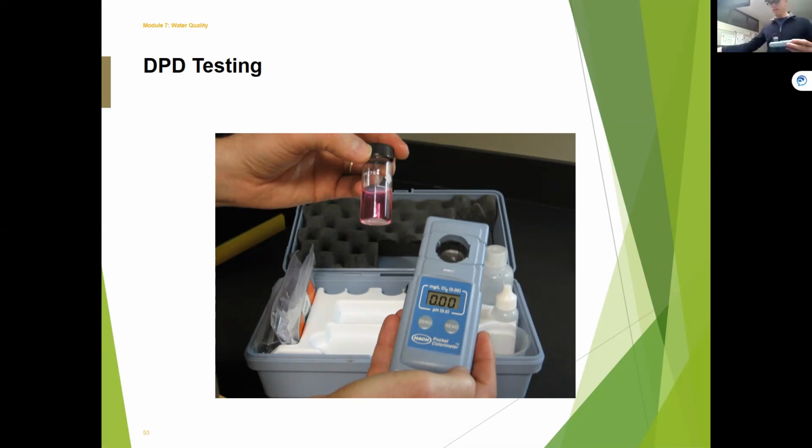When that goes in here and you shine that light source through there, you want to make sure that it's going through the vial, and that the glass isn't going to compromise your reading of what's inside the unit in any way, shape, or form. So you always have to make sure of that. Again, proper vial care, I don't care what unit you have. I always hold it by the lid, or the very bottom, and I try never, ever to touch that middle part. Be very, very careful with it.